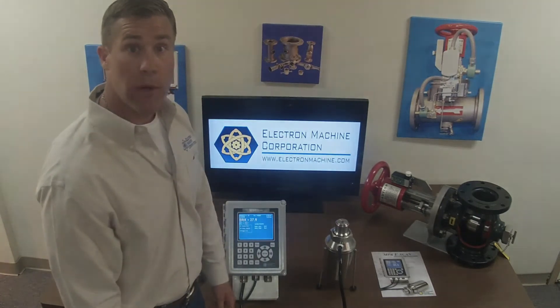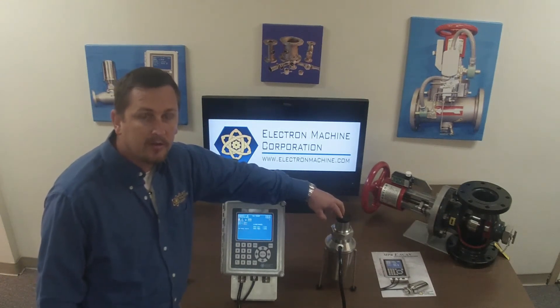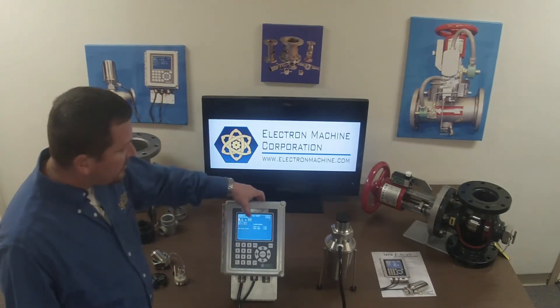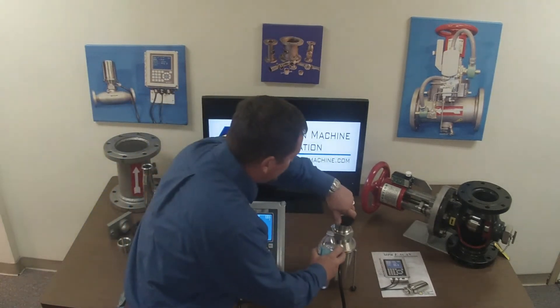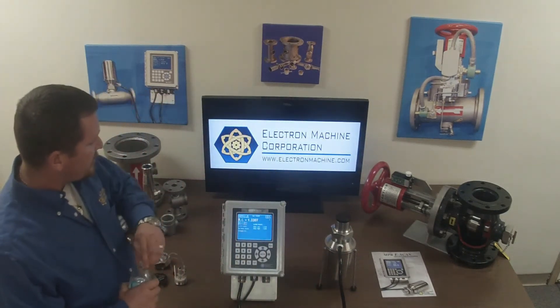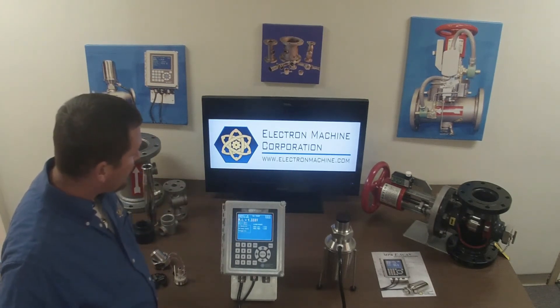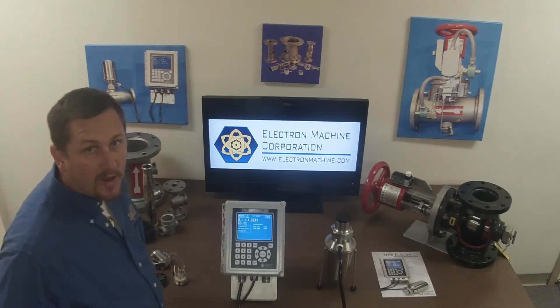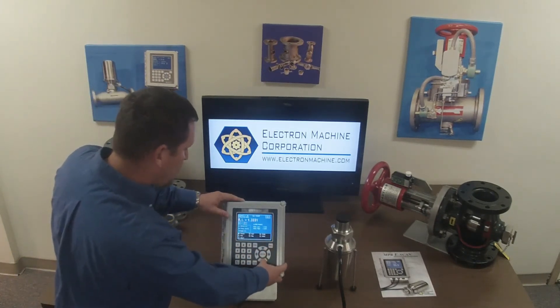Now we'll give you a quick demonstration of how the instrument works. We've put our sample cup on top of the sensing head so we can place an actual product on it for a reading. We're displaying RI — refractive index — which some customers prefer. Right now the unit is showing question marks, which is perfectly normal with no product on it. We'll start by putting some normal water on here. As you can see it's starting to read the product and we're at 1.3330, which is correct. We'll go ahead and calibrate it: store the current reading and tell it that it should read 1.3330. Now we're reading dead on — zeroed to water.